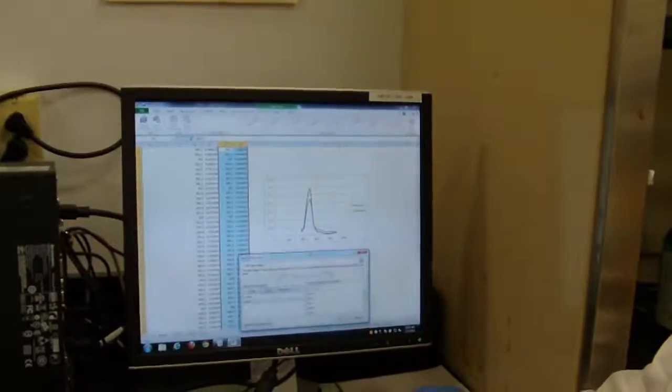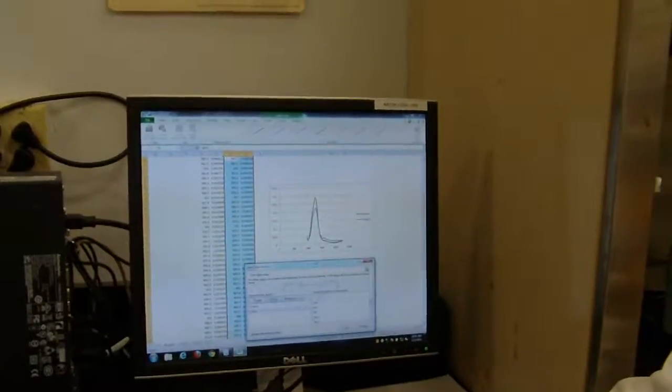All right, so we're just going to do that for the 60, 40, 20, and 10 percentages, correct? Right. Different molarities, different concentrations. All right, so we'll leave you to that, and we'll come back when you get done with that graph, okay? Sounds good. All right.